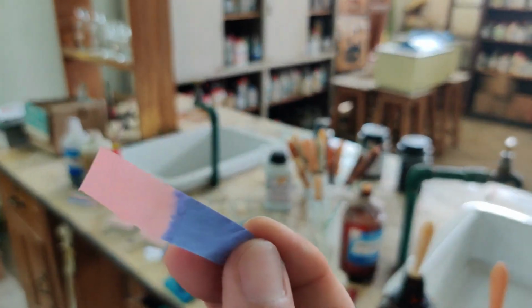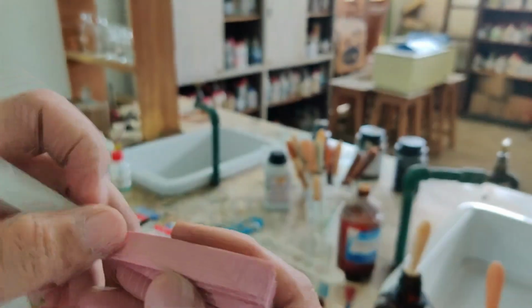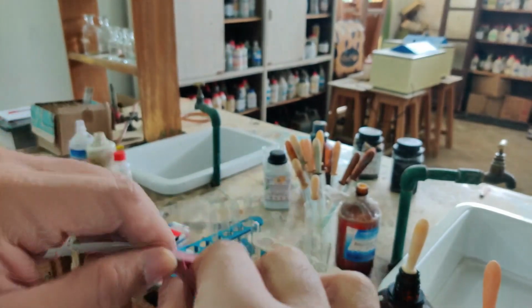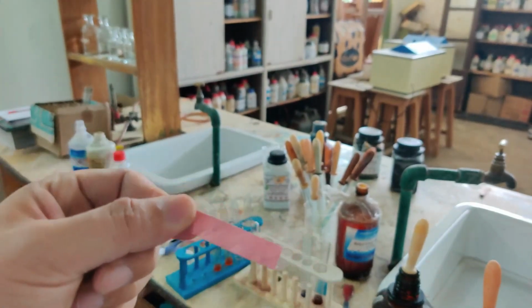Okay, now let's go to the next paper. I am going to take now the red paper. You can see red litmus. This is red litmus paper. If I am taking the red litmus paper here, nothing will happen if I am adding an acid here, because red litmus will turn to blue when it is a basic solution.